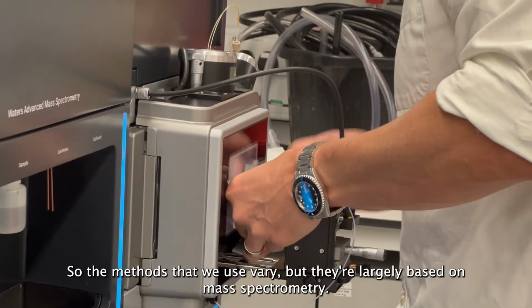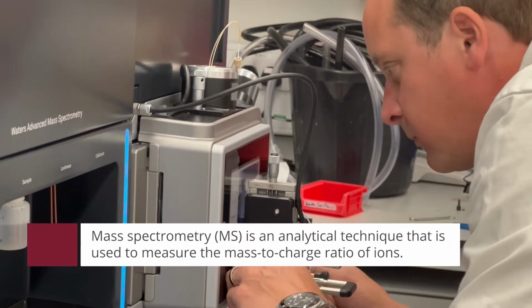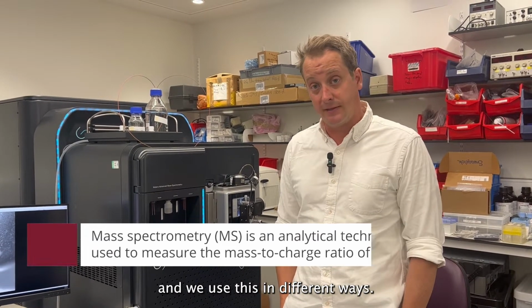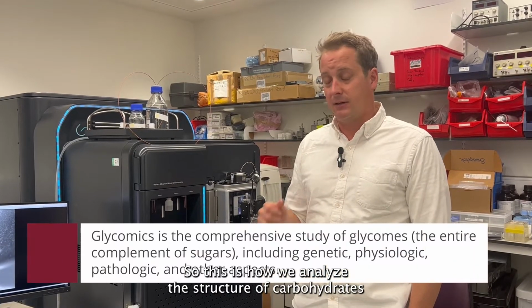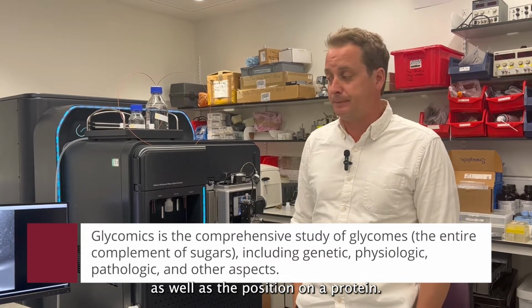So the methods that we use vary, but they're largely based on mass spectrometry. So this is an ion mobility mass spectrometer, and we use this in different ways. One of the methods that we do is glycomics and glycoproteomics. So this is how we analyze the structure of carbohydrates as well as their position on a protein.